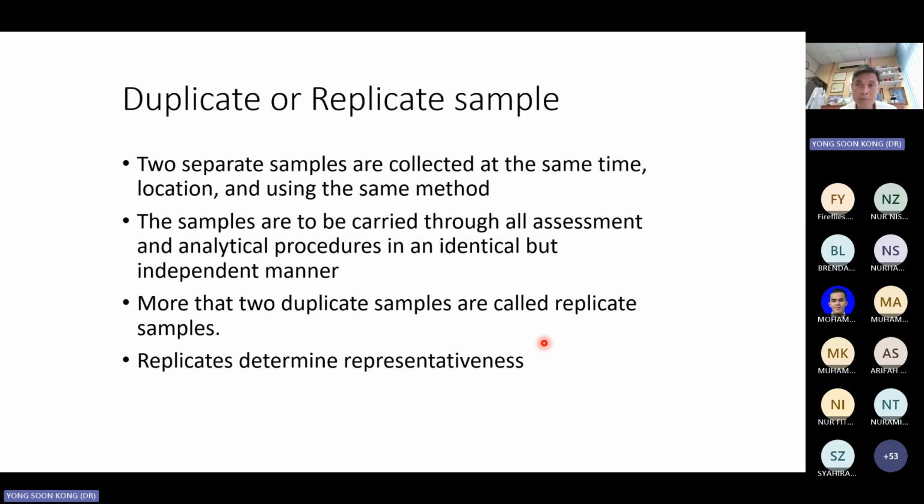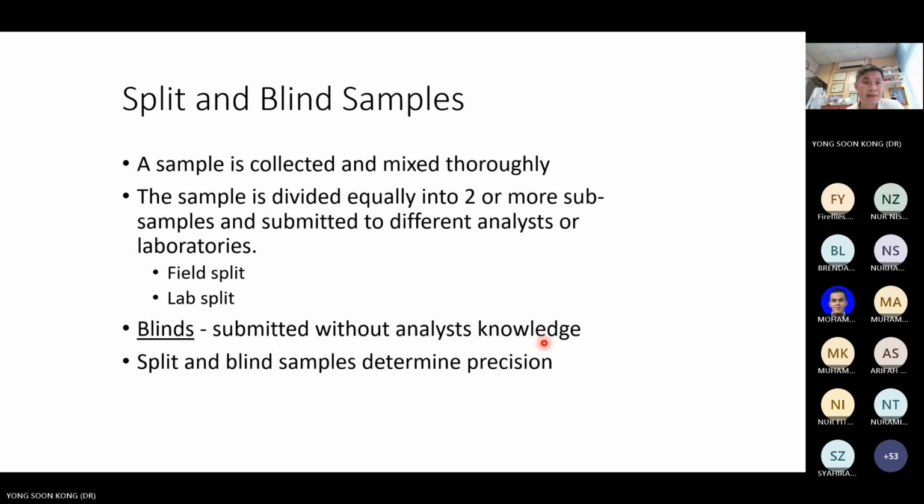So if you know your sample is highly unhomogeneous, then replicate is the answer, as many as you can. Kalau larat lah. Yeah. Of course lah, replicate ni, we will calculate the standard deviation and determine how much of random error. Itu wajib lah replicate. Sebab tu I cakap, all your experiment can replicate because we want to know how randomized your data is.